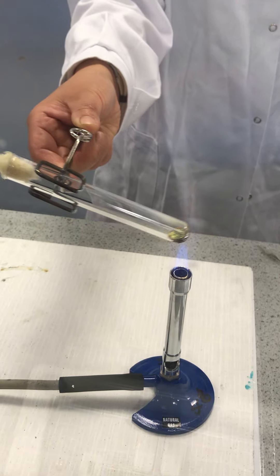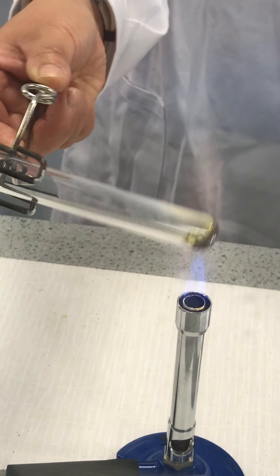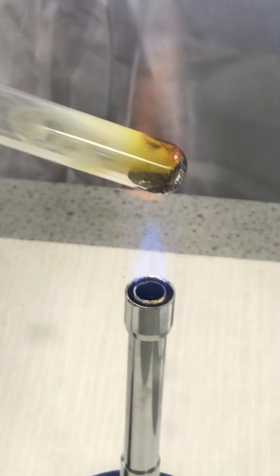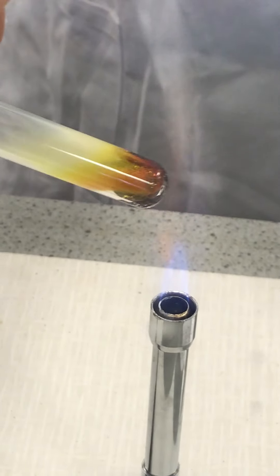We are going to heat this mixture very strongly so that we can start a chemical reaction. If you look carefully you can see something is happening inside the test tube. This is a chemical reaction which we have started using the heat from the Bunsen burner.